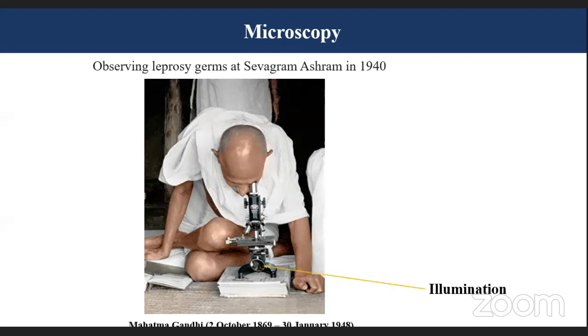If you notice, that microscope has two features. One, illumination. This illumination he is getting from the ambient light, and second is magnification. So every microscope has these two components embedded in it. These are like the basics. So either people have changed over time the method of illumination, or they have modified the magnification.